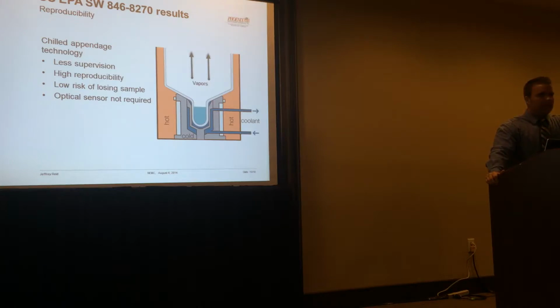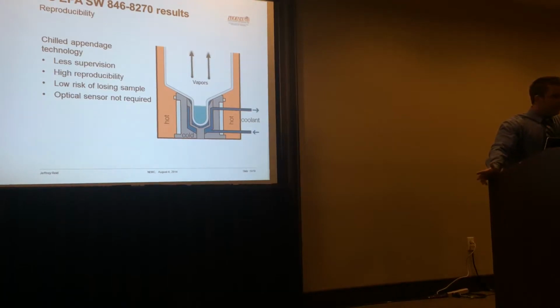You would have to be very harsh with it, use a very low vacuum setting to pull off. Why? Because dichloromethane, again, has a boiling point of 40 degrees Celsius, and it's chemically proven that it cannot evaporate off at 10 degrees Celsius, even with reduced pressures. But there's a balance you just have to work out.